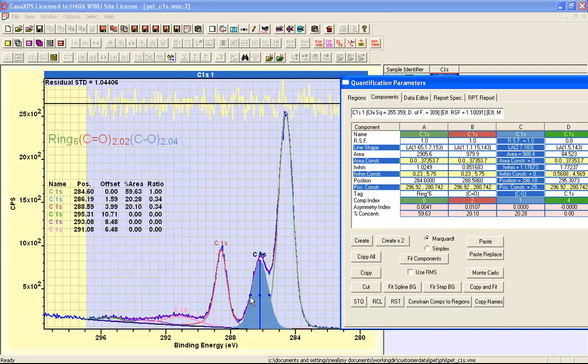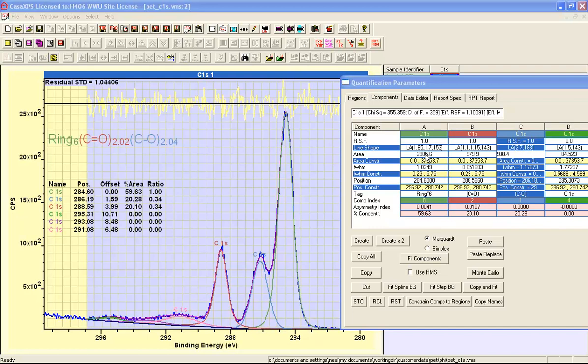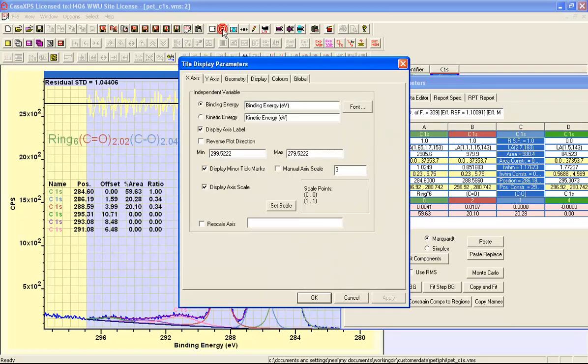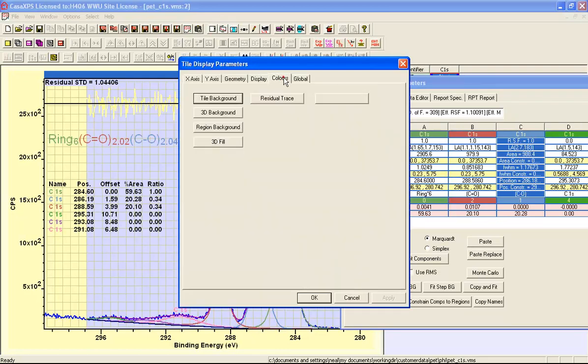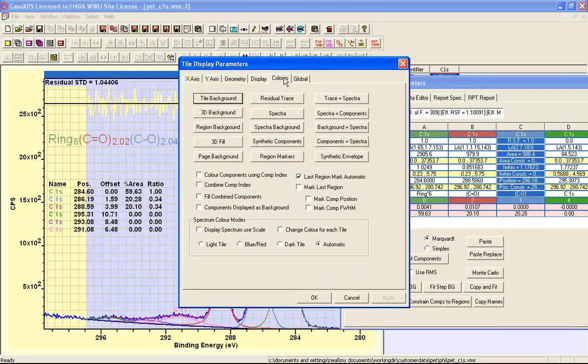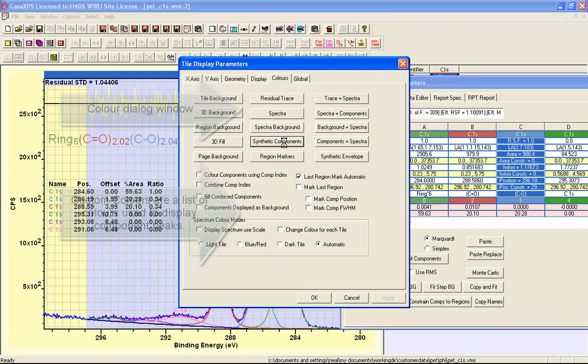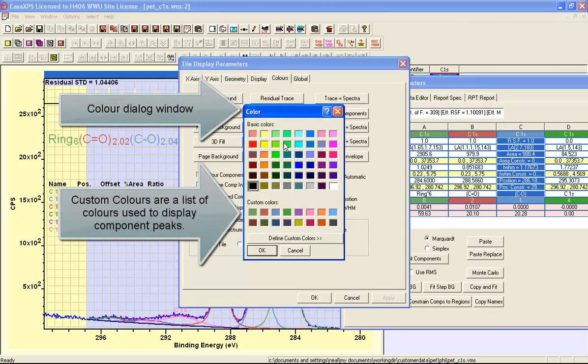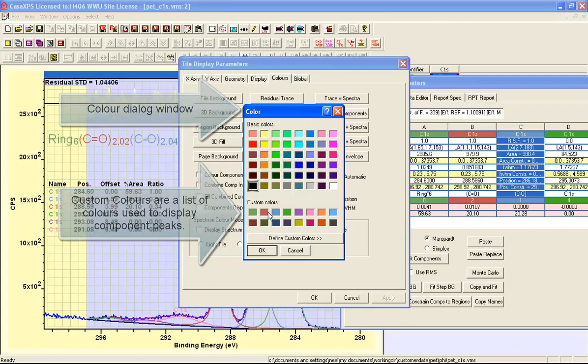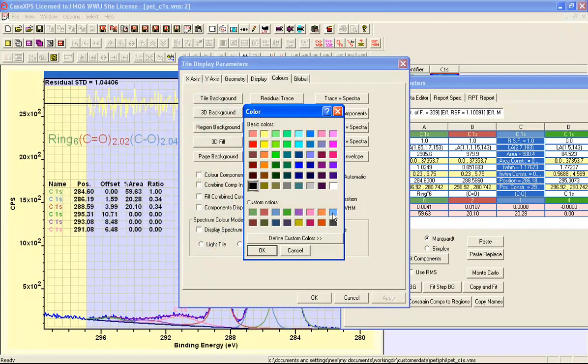The colors used to display these components are defined on the color property page of the tile display parameters dialog window. We look at the synthetic components button and it produces a dialog window that lists a set of colors and these colors correspond to the colors used on the components property page in the same order.